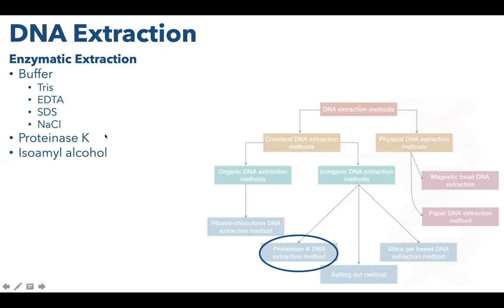Its disadvantage, however, is that it's a longer technique. So it takes on average 2 hours to incubate your DNA sample with proteinase K before you proceed to the precipitation step.